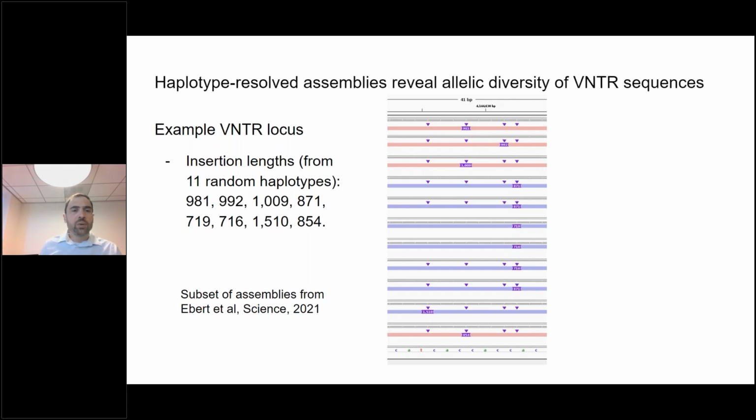And in this particular instance, we have 8 different sizes in 11 assemblies, but there's only one variant that's actually chosen to represent all this diversity. And not only that, that single variant is just represented by a length increase. So it doesn't have any of the extra information for the motif changes that are potentially happening here and are potentially having functional impact.